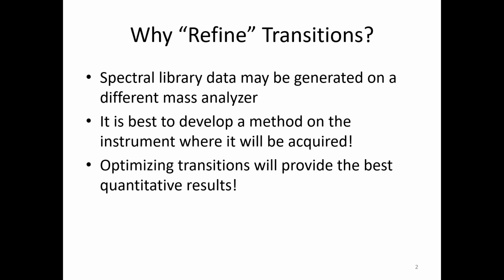And the idea here is, you might have a peptide candidate that looks great, it's got a lot of product ions, but you don't necessarily need to monitor all of them on a triple quad. You get all of them for free if you're doing parallel reaction monitoring, but if you have a triple, the number of transitions you're monitoring directly impacts your cycle time, and you might not want to monitor all 9 or 10. So the idea is, how do you pick the best ones?